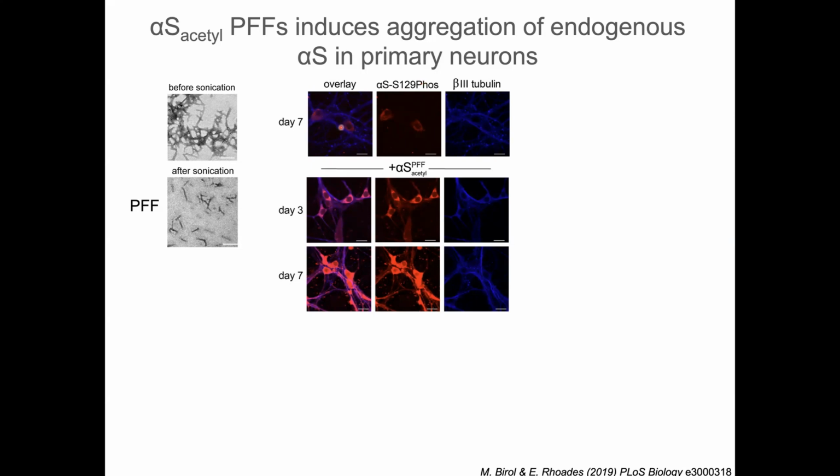So you can see we have a little bit in the cell body under sort of normal conditions. But for cells that we've treated with alpha-synuclein aggregates, that's what the PFF is, you can see that by day 3, we're seeing a whole lot of that red signal already. And then by day 7, it's pretty much filled up the cell body as well as spread down to the neurites. And I'll tell you that we only measure through day 7 because by day 8, so many of our neurons are dead. We can't really take pretty images of them, right?